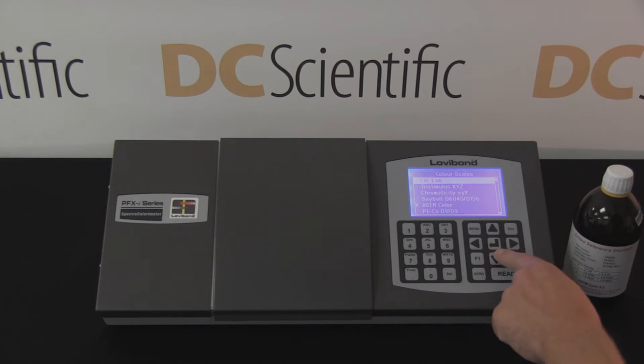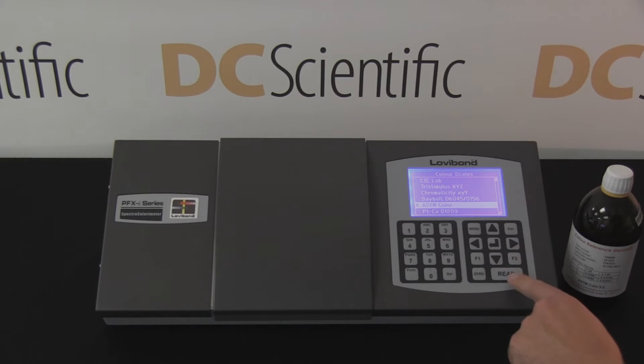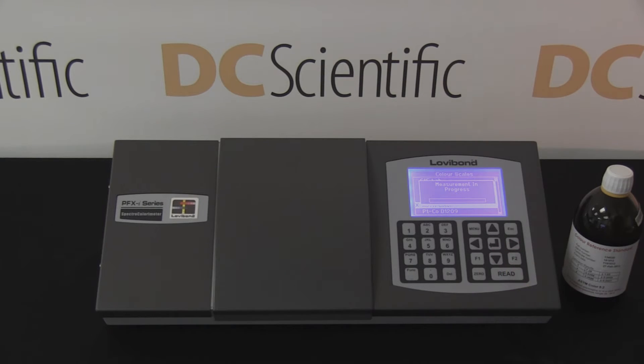The technician selects the appropriate color scale, ASTM D1500 for ASTM color, and presses the read key. The measurement takes approximately 25 seconds. Progress of the test can be monitored on the on-screen status bar.